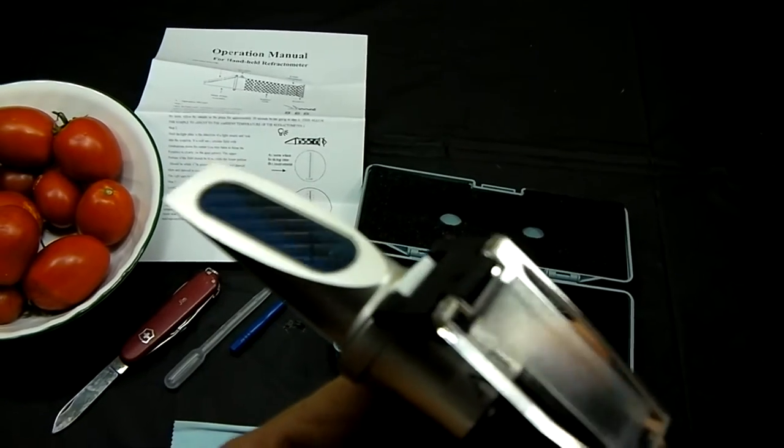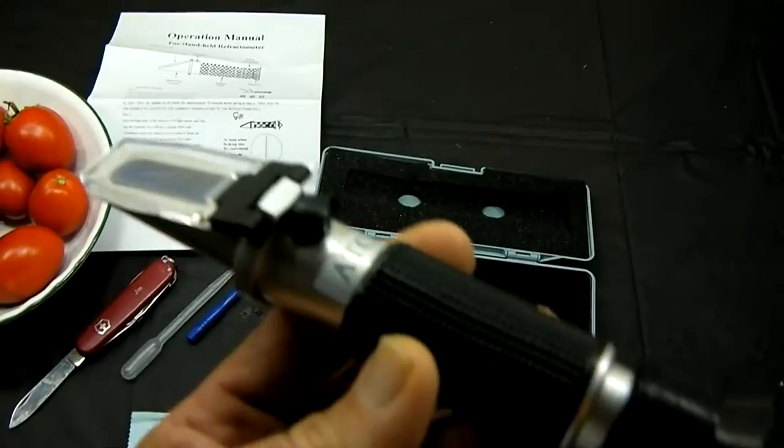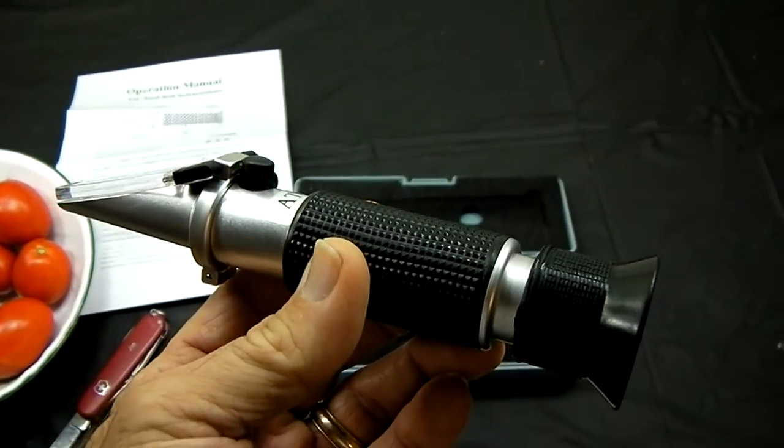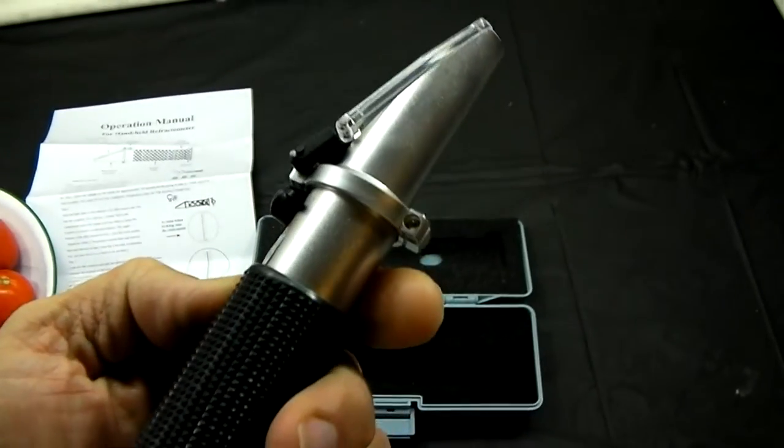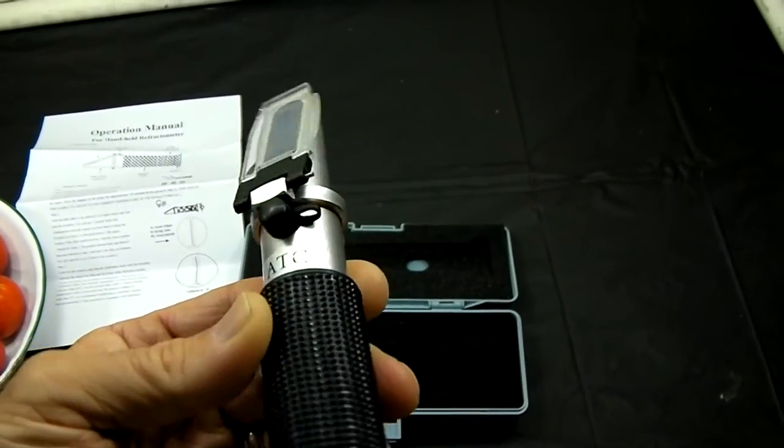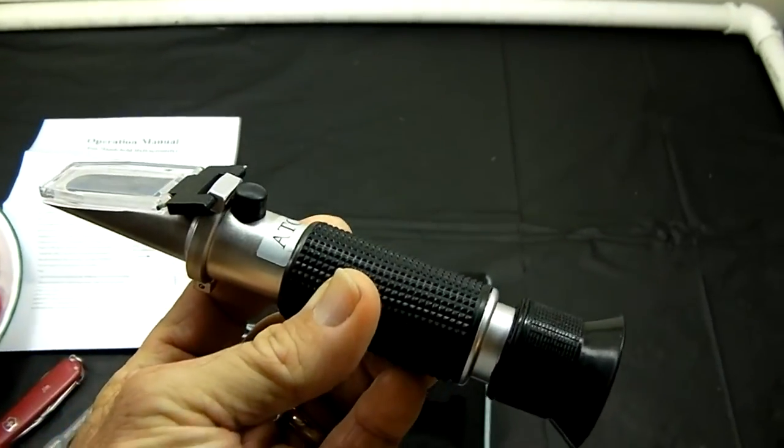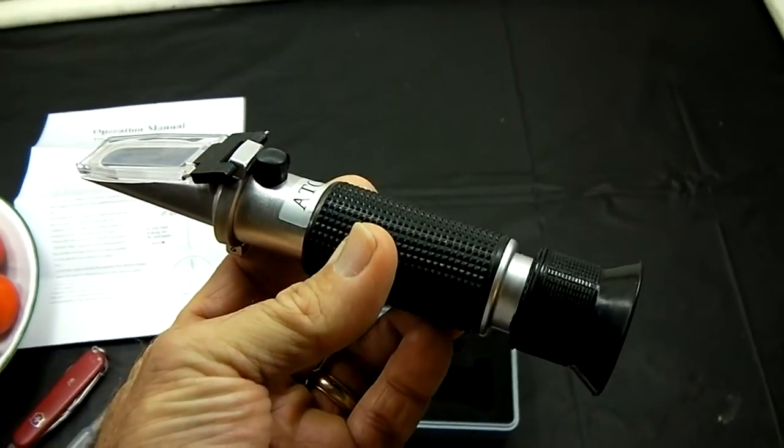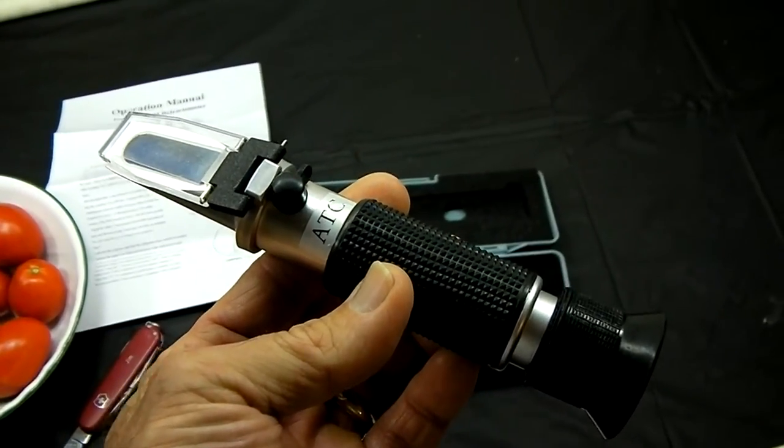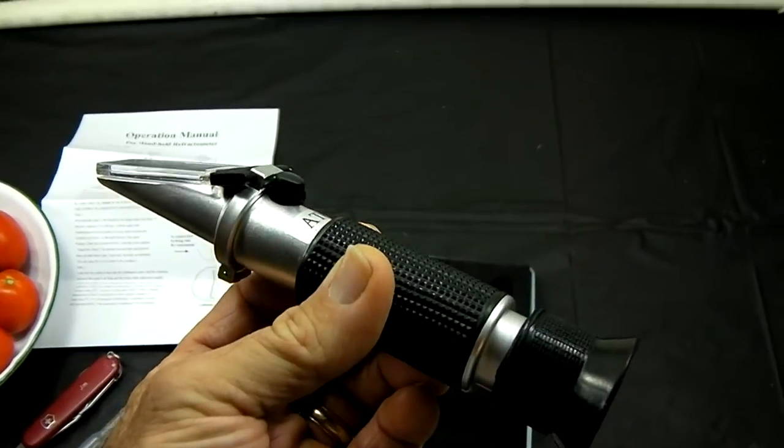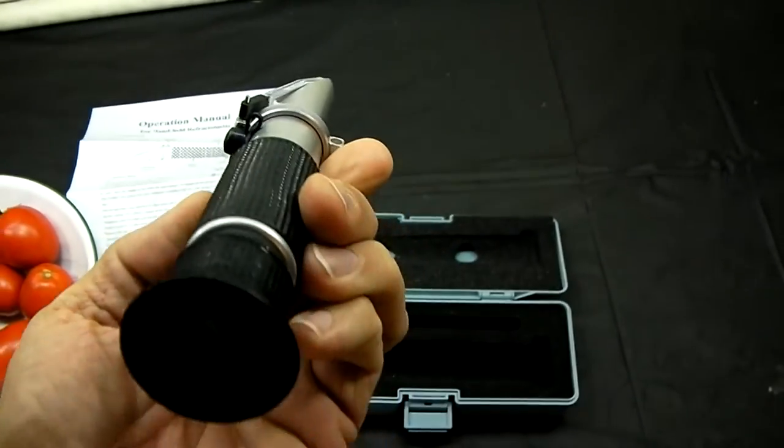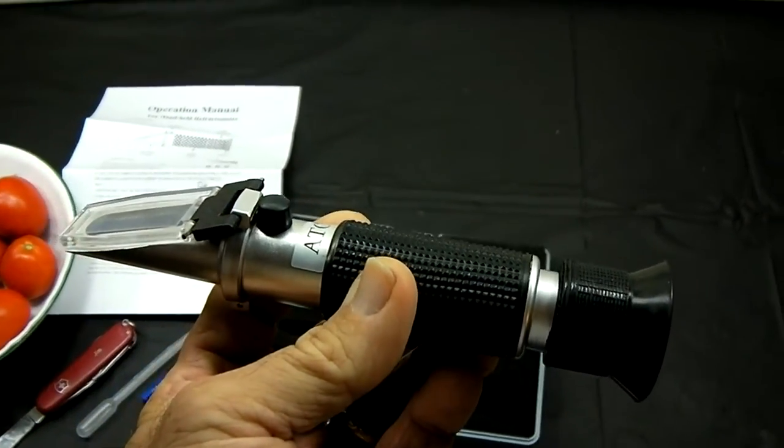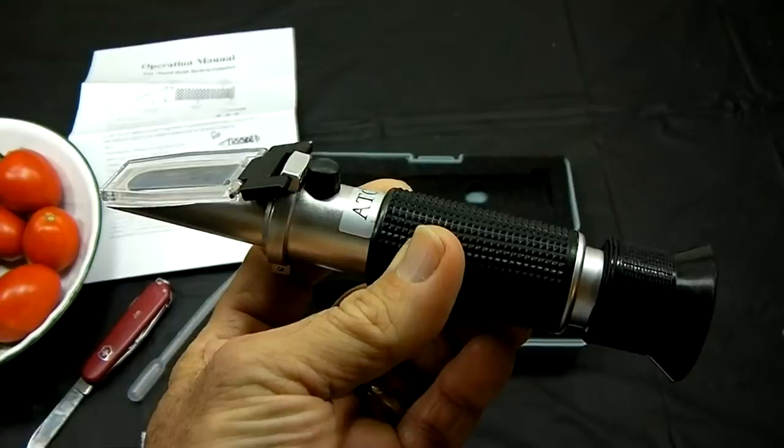It's a very well polished glass. Now, this particular model here, I got from a company off of eBay, and I paid around $35 for this one. It's made out of aluminum. It's very heavy duty. This is a temperature control version. These range in price anywhere from around $30 up to $100 plus, so you have to shop around. They're all pretty much the same. I was very pleased with this and very pleased with the company.